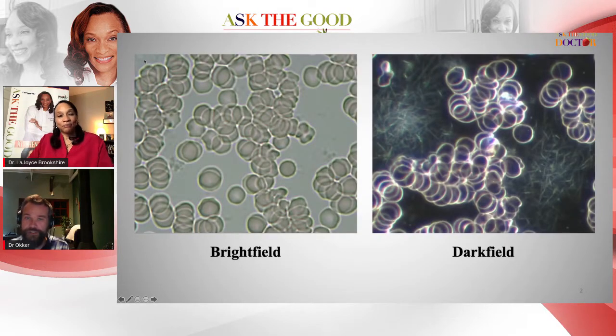Okay, so this is just an example of the types of views that we usually get with a live blood sample. The example on the left is your standard bright field image, where the light simply passes through the sample from the light source into the objectives. There's a few things that we can see with that, but the real value comes in with the view on the right-hand side, where we have a dark field condenser being used, and you can see all the lines and other structures between the cells that become visible in dark field. So that's where the real power of live blood analysis lies.